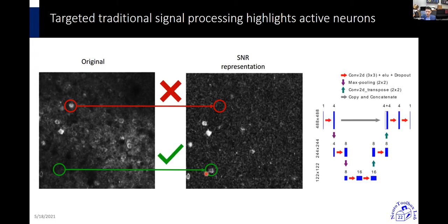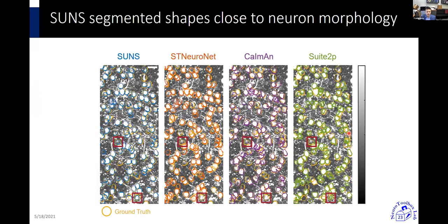And it turns out we can use a very shallow UNet network structure where there's only 3 depths. You can see this is much more simplified compared to our previous network, but it's good enough to do everything, specifically finding neurons in our algorithm. So this was great.